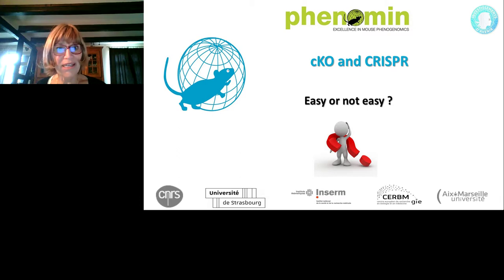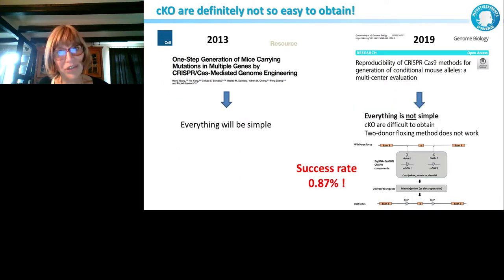That's the question. Then, to remind you, I don't know if you followed all the literature, but in 2013, at the very beginning of CRISPR, there was this paper coming out from Rudolf Jaenisch's lab, saying that everything would be simple. They showed that everything is efficient, that it's possible to target 3 genes together, to get conditionals easily. But all they did here was analyze functional loss.